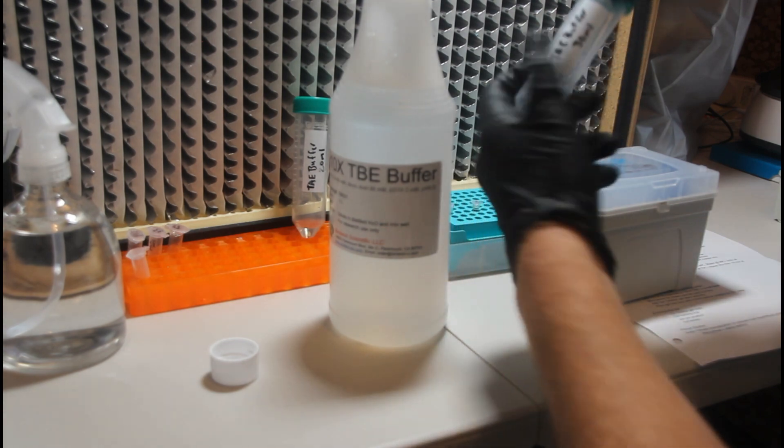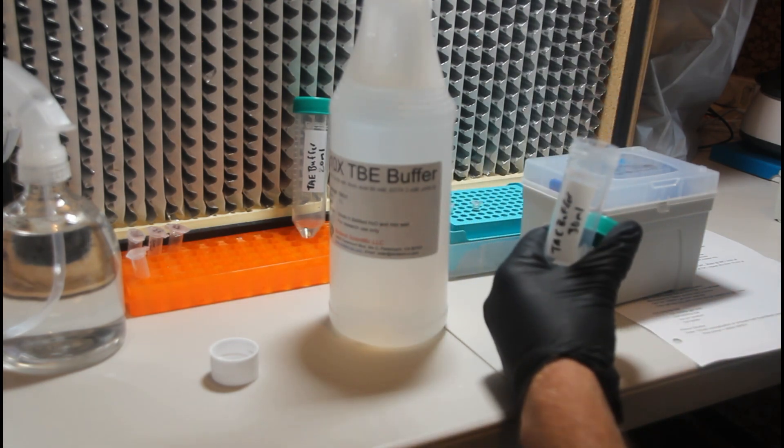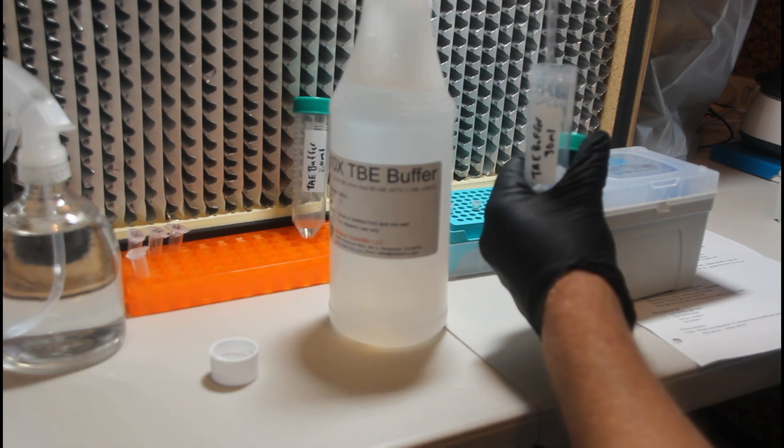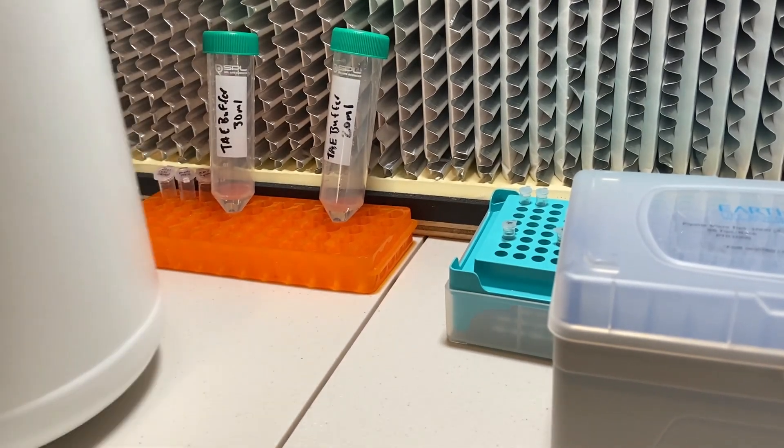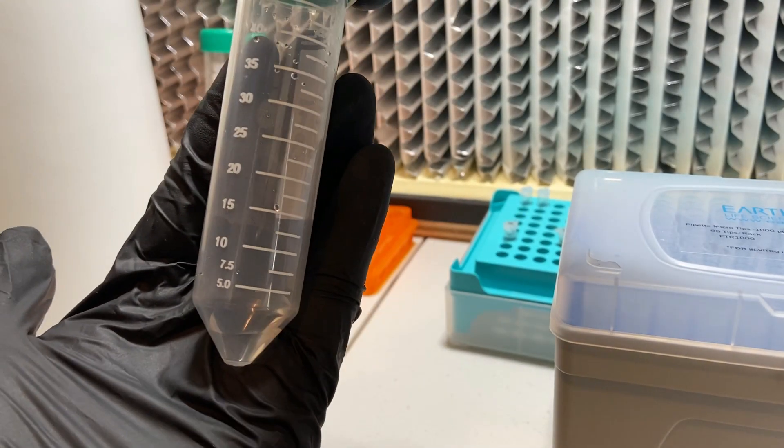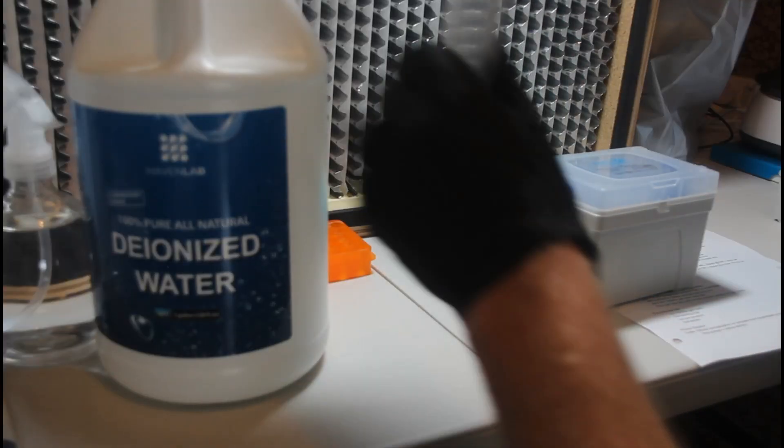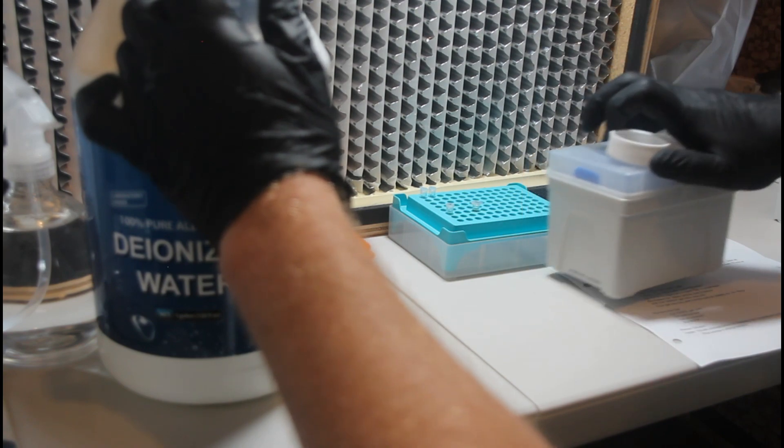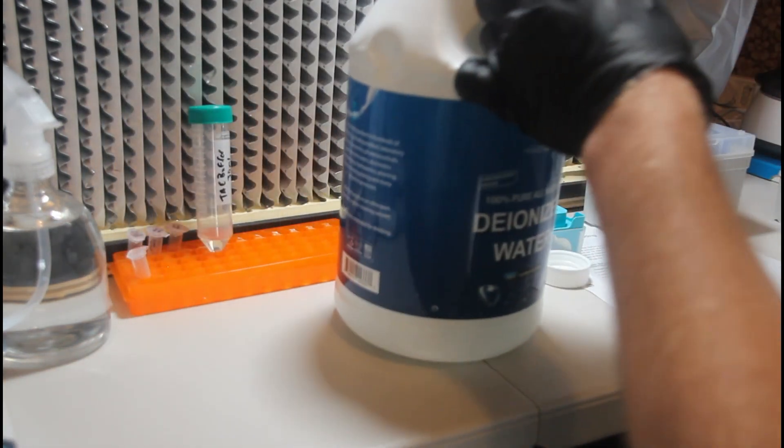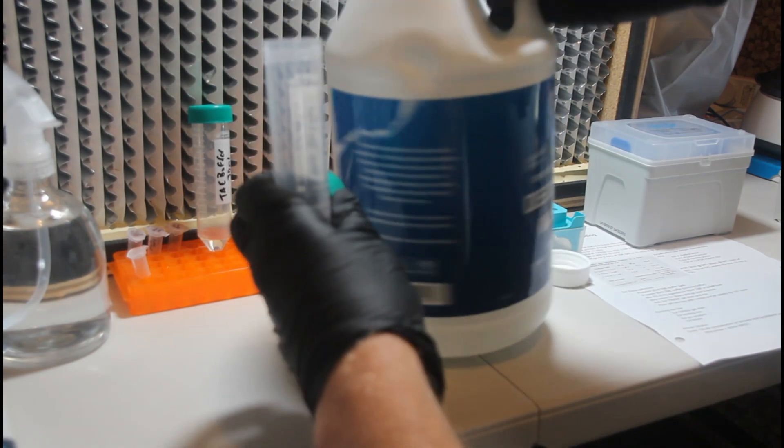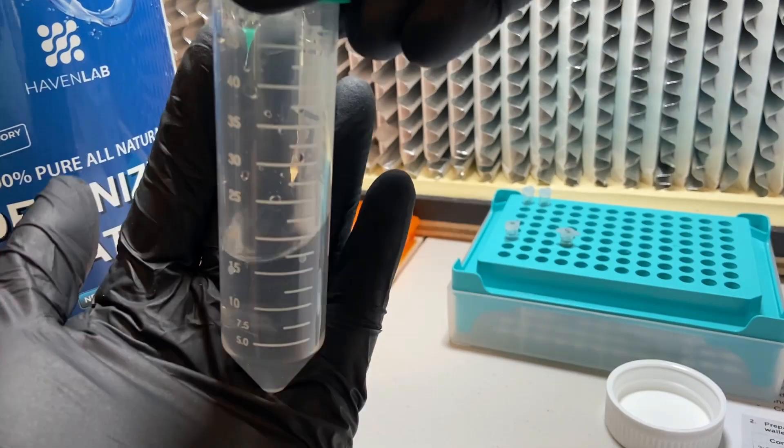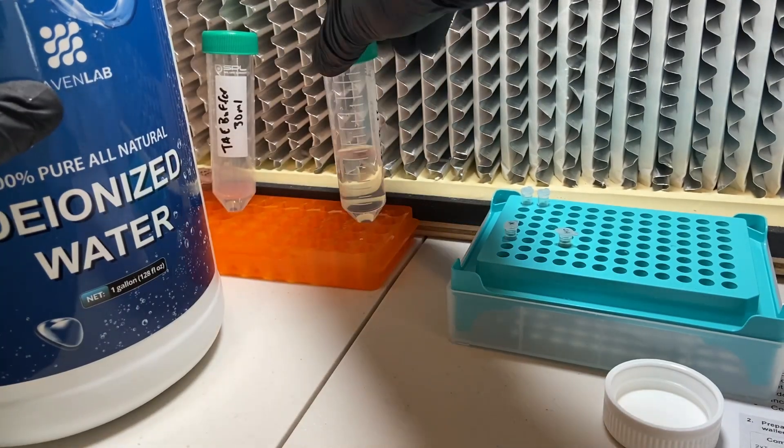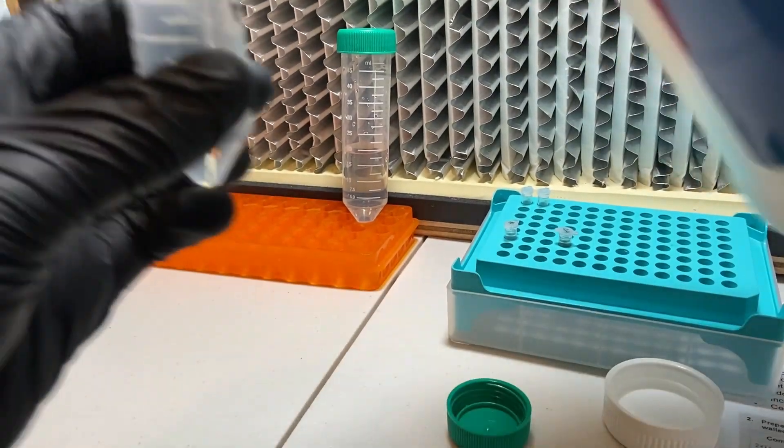To create the 20 milliliter 1X TBE buffer that we need for the gel, we'll just repeat the process, but we'll use 2 milliliters of the 10X TBE buffer, and then we'll fill up a separate falcon tube to the 20 milliliter mark with deionized water or distilled water, either one would be fine. Make sure that when you are creating your TBE buffer solution from a stock concentration, that you double check that your concentrated buffer is very well mixed.